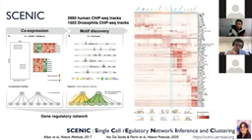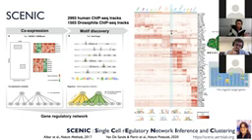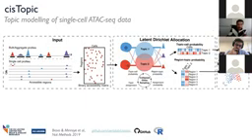So this is the result on the eye disc. Here you can see the transcription factors that are found with regulons, and these are all the cell types. For example, in blue here, we see the atonal regulon to be active in this morphogenetic furrow. This has 106 predicted target genes. Here's the expression of atonal in the second antennal segment and in the morphogenetic furrow. And this is the activity of that regulon, of this entire gene set, in that tissue. That's with RNA-seq. What about the single cell ATAC-seq? That we can also use to predict transcription factors.